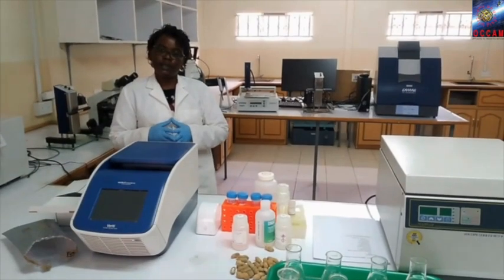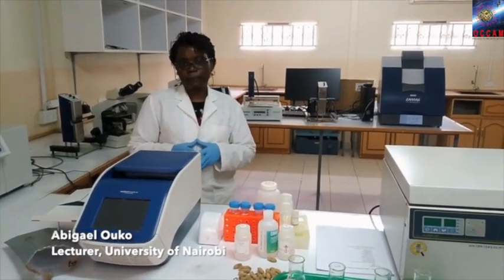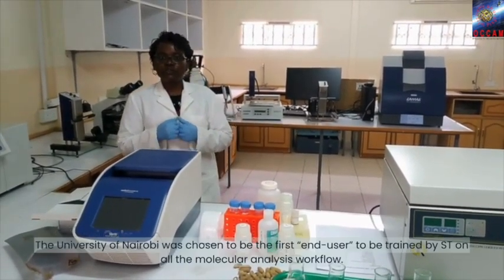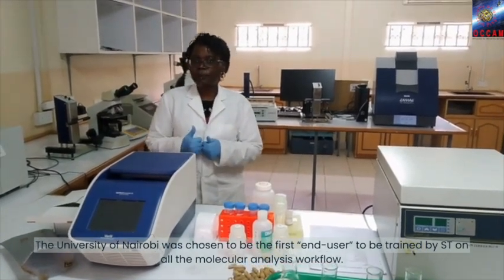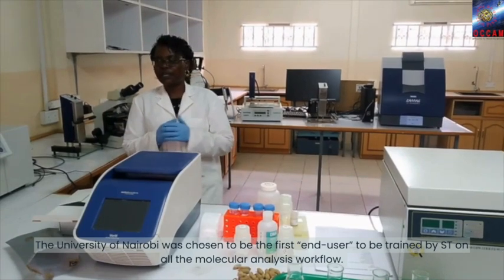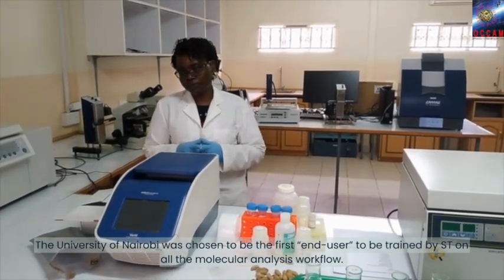Abigael Ouko. I work at the University of Nairobi, Kenya. I am a geneticist. The University of Nairobi was chosen to be the first end user to be trained by ST on all the molecular analysis work.